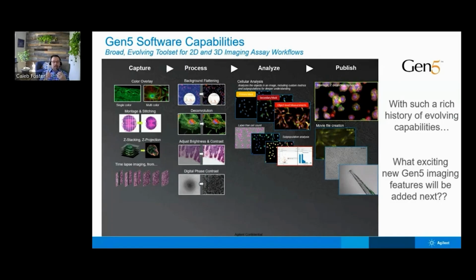So if you've added the same amount of fluorescent dye in all the wells, and the cells have this variation of responses, we're very confident that we have high reliability in the fluorescent quantification well to well, to be able to compare things like gene expression or other fluorescent based applications. Brilliant, thank you very much.